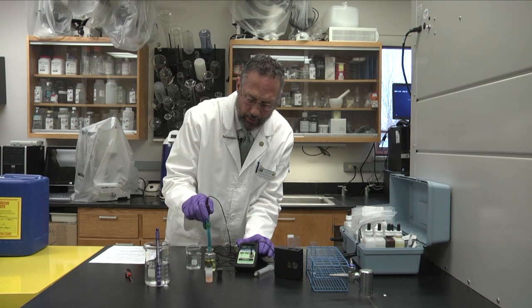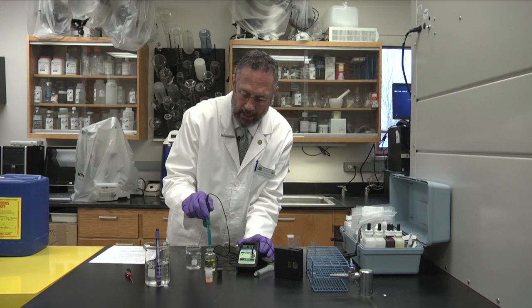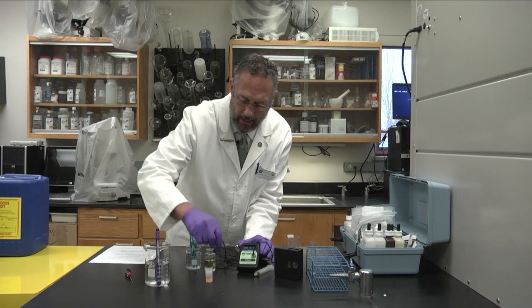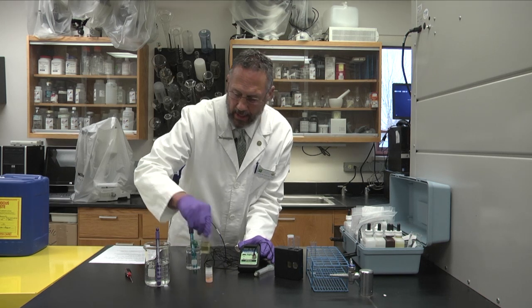At this point I will remove the probe from this calibrating solution pH seven calibrating and I'll rinse it off in this distilled water here. I'll plug this pH seven solution back up and set it aside.